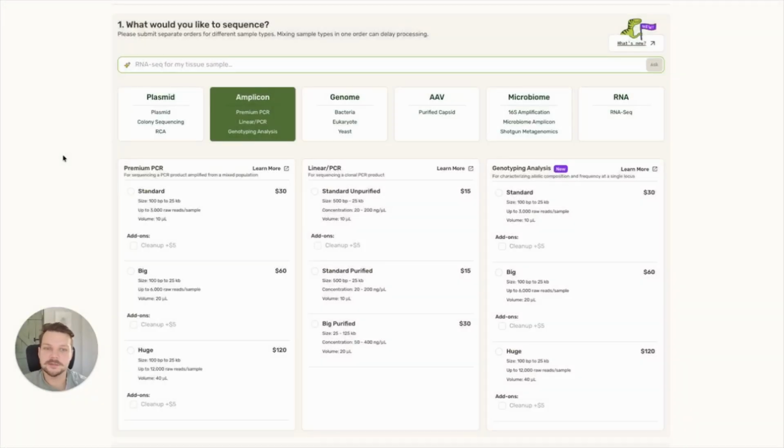Hi everyone! In this video, we'll show how to place your first order with Plasmidsaurus.